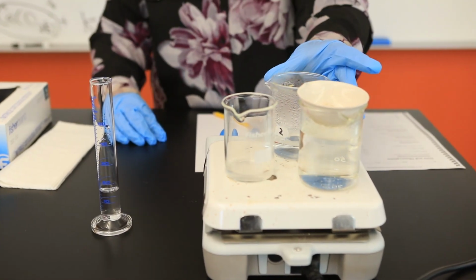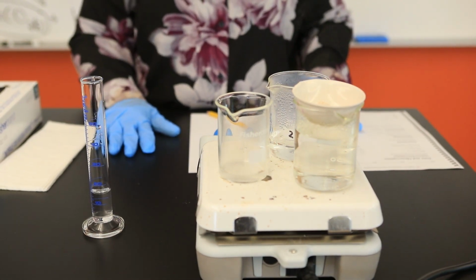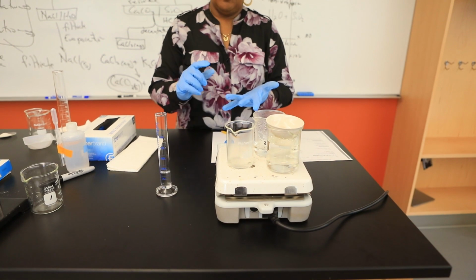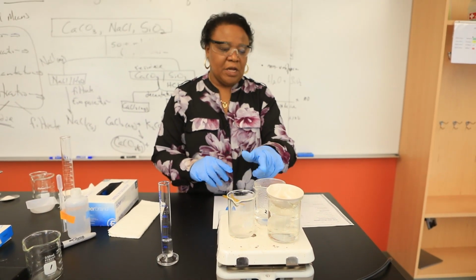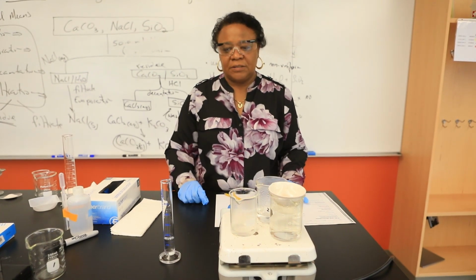And that's, of course, a chemical process. So yes, so far we've completed several physical means of separation. We did extraction. We extracted our salt using water. We performed our filtration. We also did what? Now we're going through evaporation, and we also performed a decantation process.